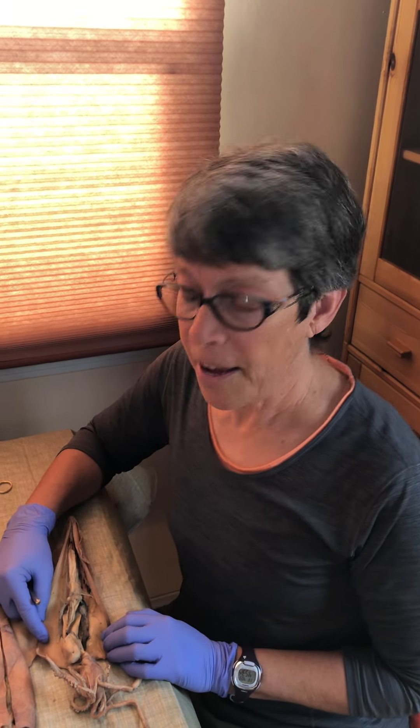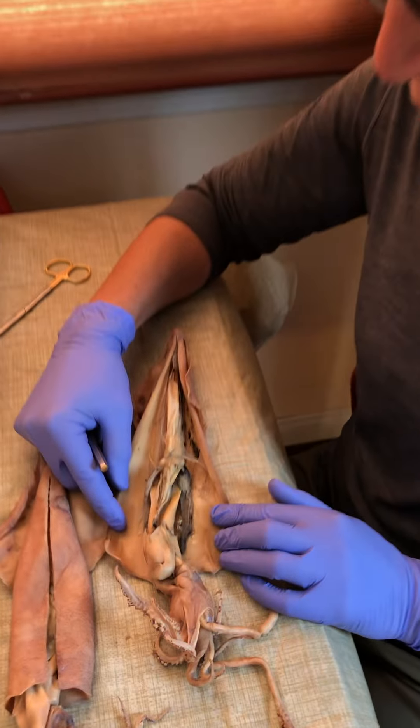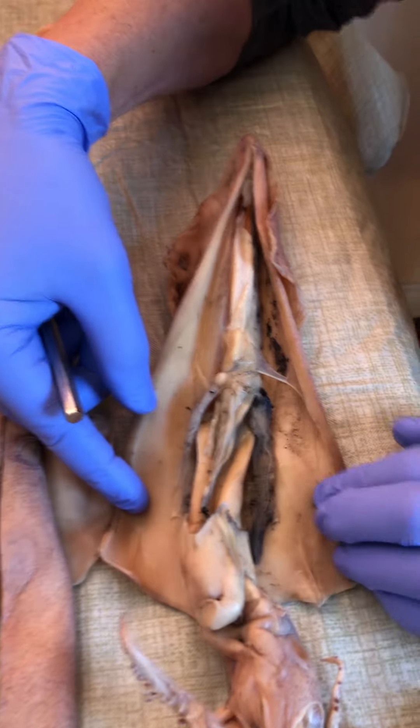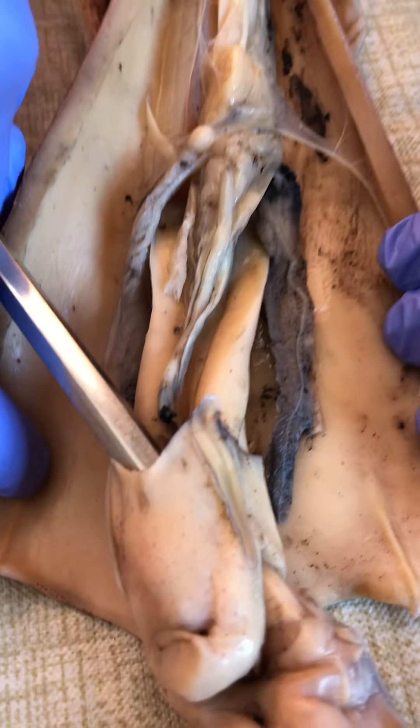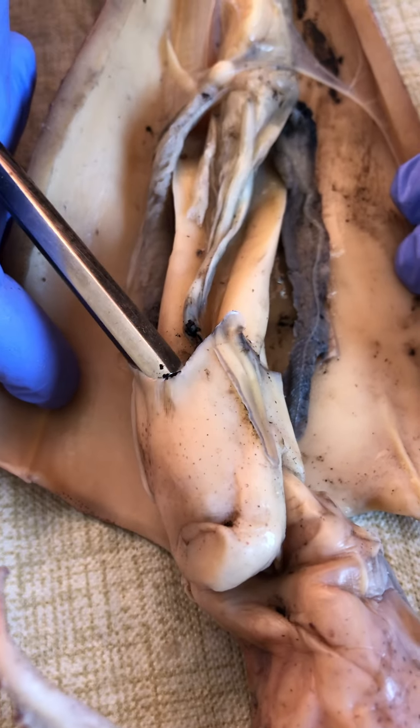Now for a look at the male reproductive system of the squid. This guy is all dissected out. I'm gonna put the probe in the entrance to his siphon.